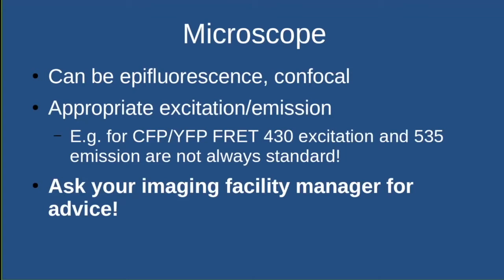But what is important is to have those sensitive detectors and to have appropriate excitation and emission filters or spectra. So for CFP, YFP, FRET, for example, most microscopes as standard don't come with a laser in the sort of 430 to 440 range, which is what you really need. And also you need to be able to measure emission in the sort of 535 range, which is, again, not always standard. And I would always advise anyone, if you're thinking about getting a biosensor in and doing some of this sort of imaging, to have a chat with your imaging facility manager. It's one of the most helpful and useful things you can do, because they've often had experience with this sort of imaging before.